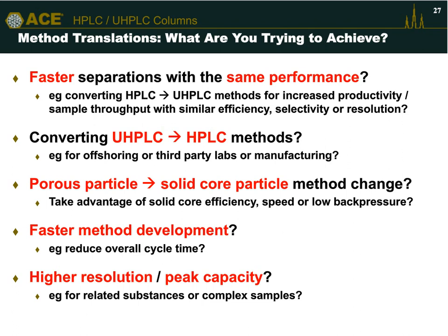So what are you trying to achieve with your method translations? Do you want the same separation, you just want it faster? Do you want to go from HPLC to UHPLC, but you want to maintain the quality of the separation in terms of efficiency, selectivity, or resolution?